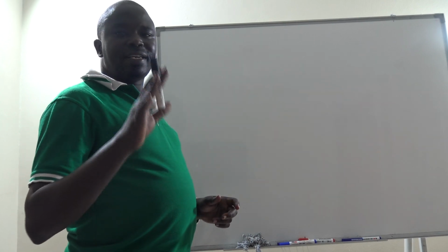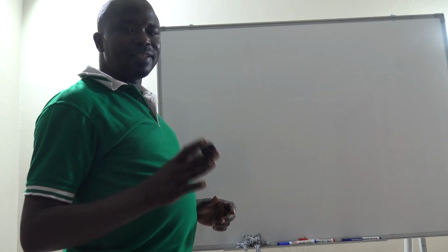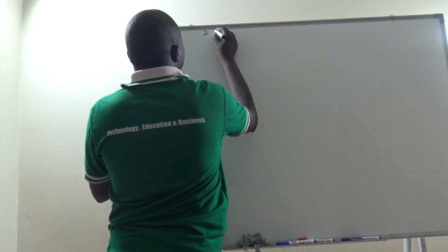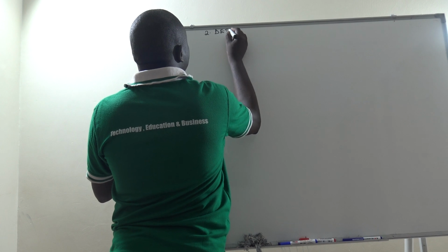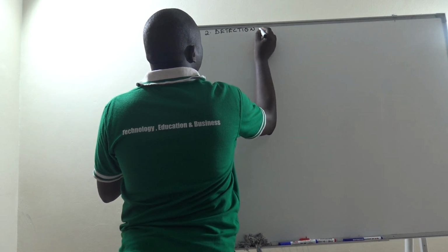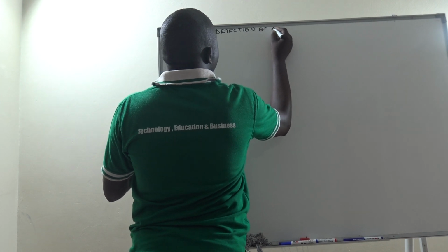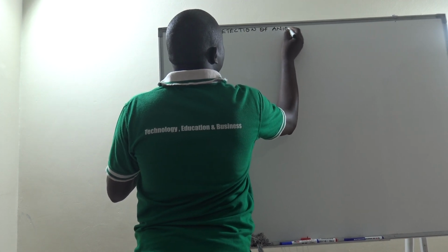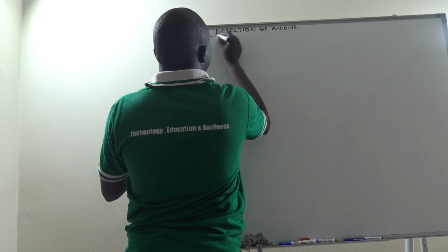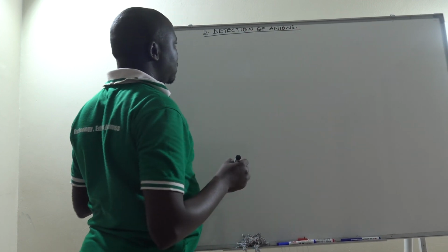Let us continue with detection of ions in solution. Since we are already done with the detection of cations in solution, let us move to the detection of anions. Let's go to the detection of anions.